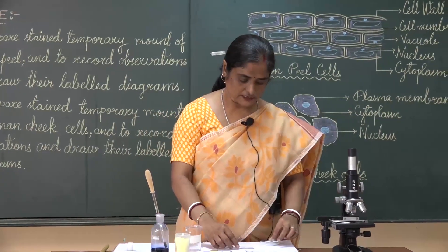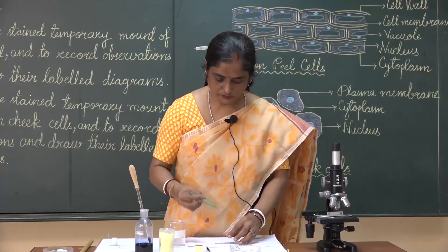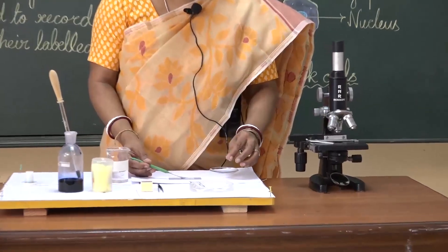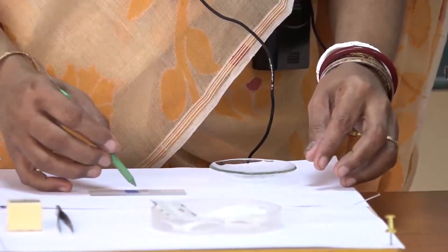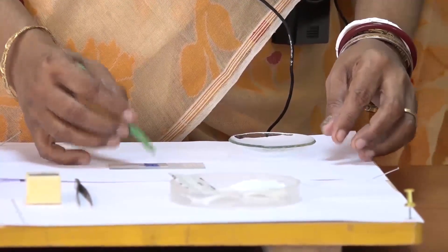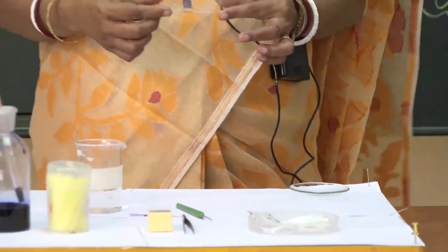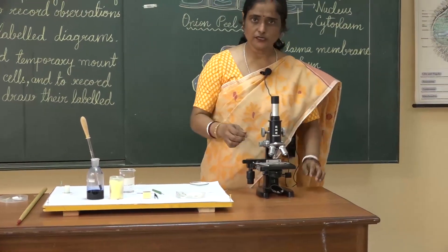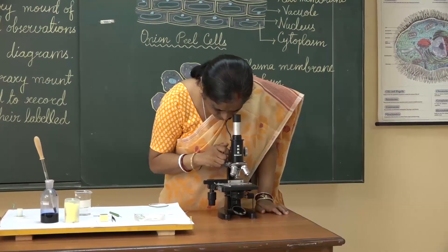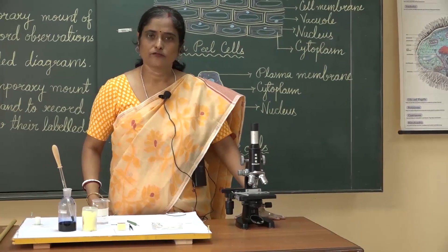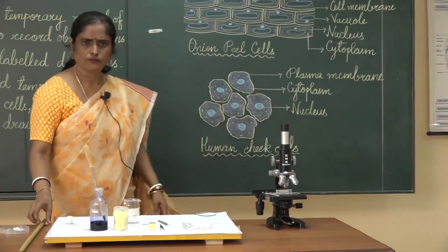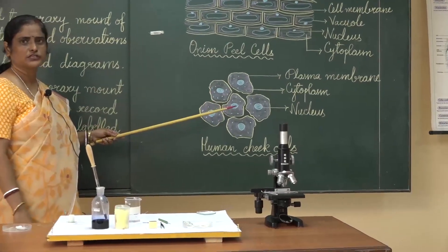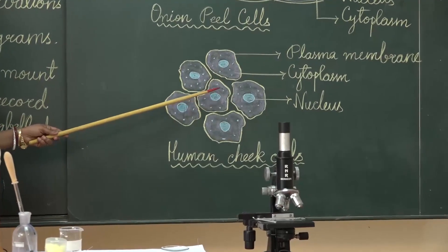Now immediately put the cover slip with the help of the needle. Gently place the cover slip over the material, tap from the back of the needle, and press it gently. Observe under the microscope. First under low power, then under high power. What do you see? We see such cells under the microscope — somewhat irregular in shape and placed close to each other.